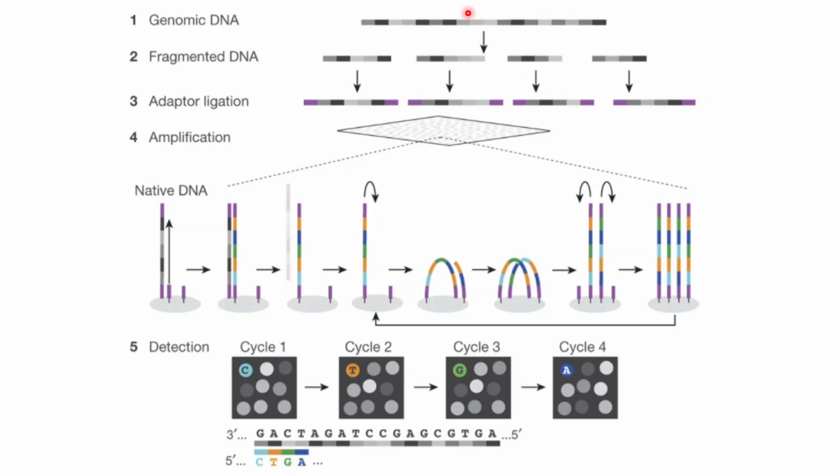So you have to collect them separately and do a quality control. You need to exclude some of the bases, because sometimes the signals tend to overlap with each other. Sometimes the signals will be slow to come up, or sometimes another signal will come in front of it, for example a G coming up in place of a T. These kinds of things do happen, or sometimes contamination will be there.